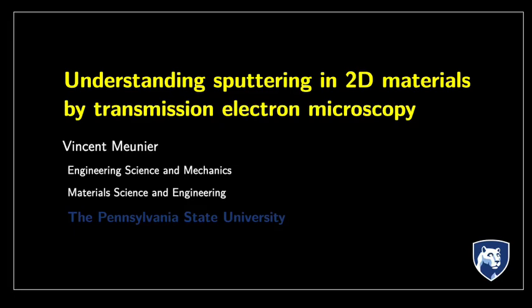Welcome back for another screencast on material science. Today we are going to talk about sputtering of atoms in 2D materials. And the sputtering takes place by transmission electron microscopy, and more specifically it is the electron beam from the microscope that does the job of sputtering.